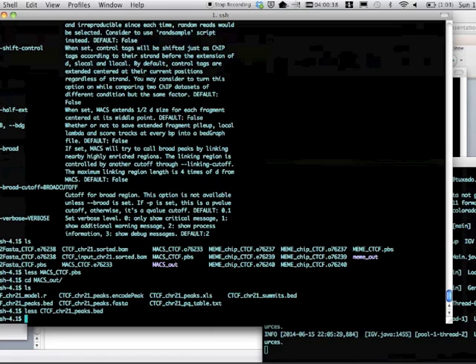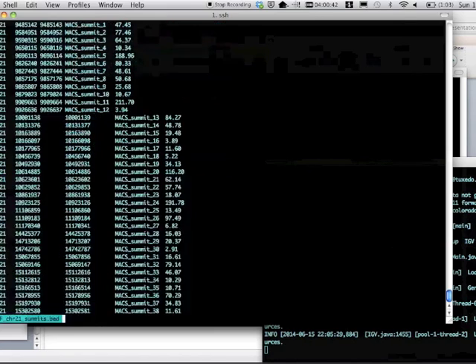The summits file is really similar to that. So instead of peaks, we put in summits. It's basically the same layout, except for this is giving the location of the summit of that peak. And so as you can see, if you look here, this is literally just one base pair. It starts at 38 and ends at 39. So it's just giving you the one base pair summit.